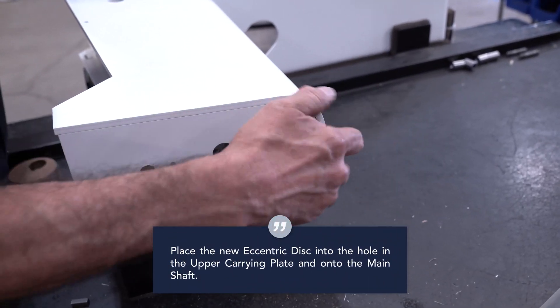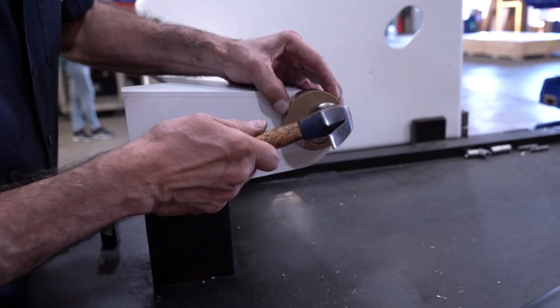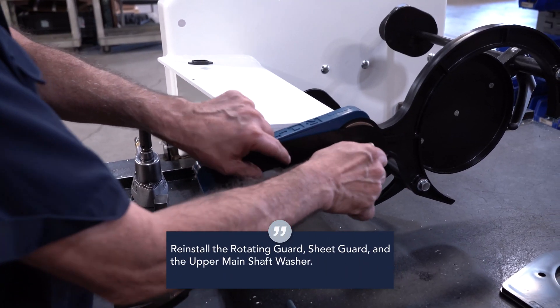Place the new eccentric disc into the hole in the upper carrying plate and onto the main shaft. Align and insert the main shaft key into the keyway. Reinstall the rotating guard, sheet guard, and the upper main shaft washer.